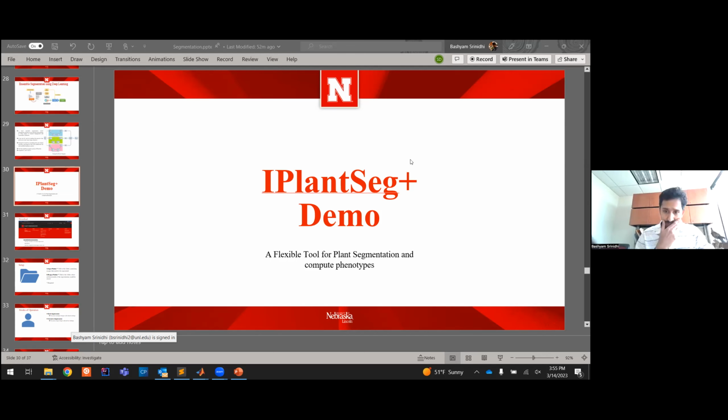Let's say I'm trying to find out a dry part in a plant, where then we need to have a lot of images, different varieties, from different plants. But sometimes we just want the healthy plant, and we need to feed those healthy regions to a machine learning pipeline, so that it learns what a dry region in a plant is. So for all these cases, we need a lot of data, a lot of segmented results, and segmentation is a challenge when it comes to a large data set.